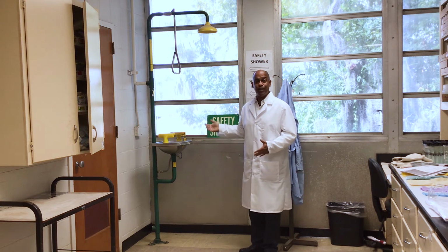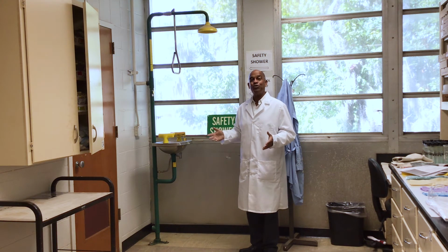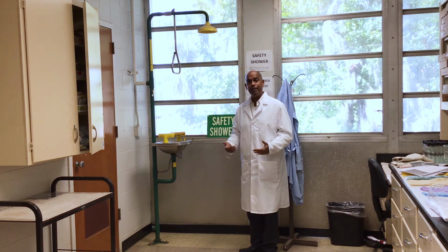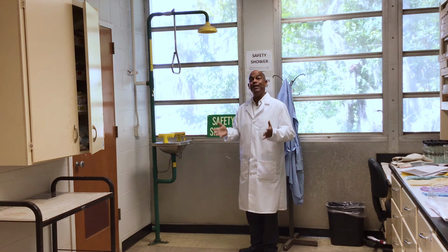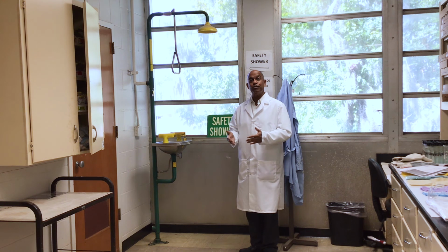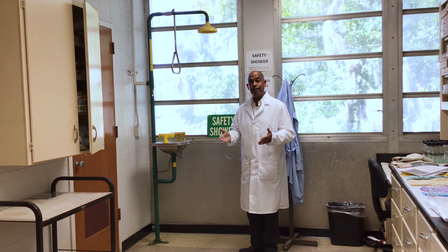This has never been used in this lab because I want to say probably luck, but also a lot of training and the fact that we really insist on being protected. We provide the right personal protective equipment: the lab coat, the gloves, the goggles, the visors. So we do have all that and we insist that people wear it. You're going to find people who are going to resist using them, but it's the job of the lab manager and the lab administrators to insist on the principles of the lab to ensure the safety of lab personnel and students and anyone that is visiting actually.